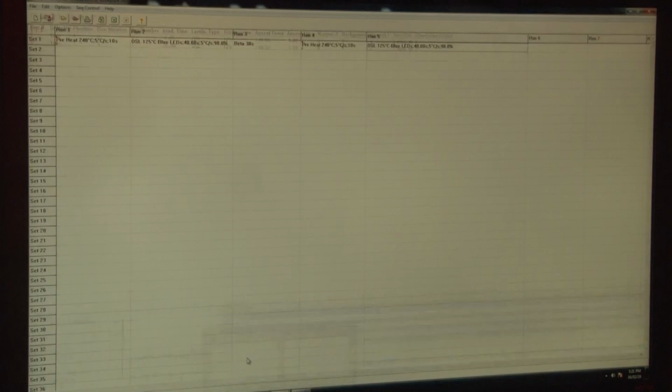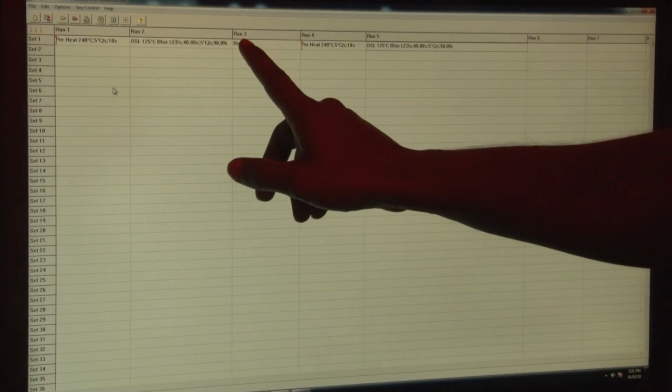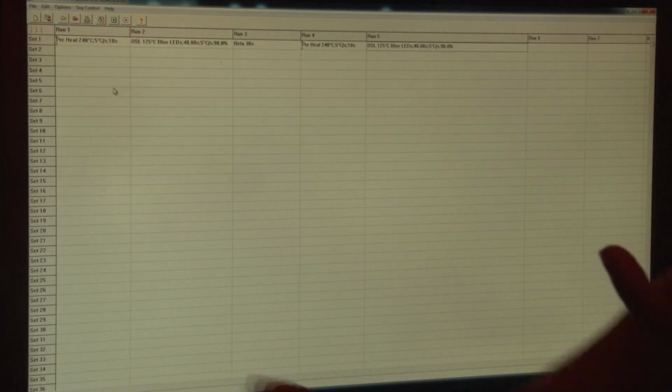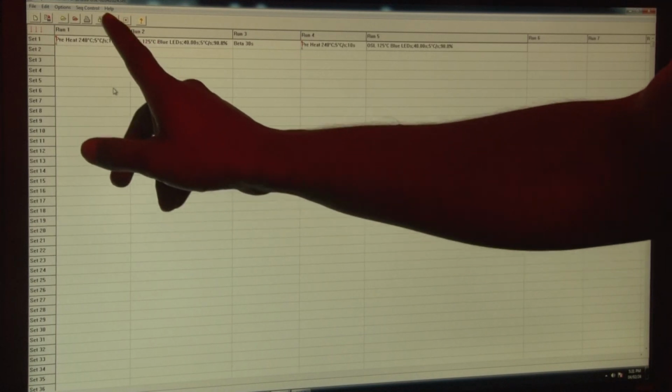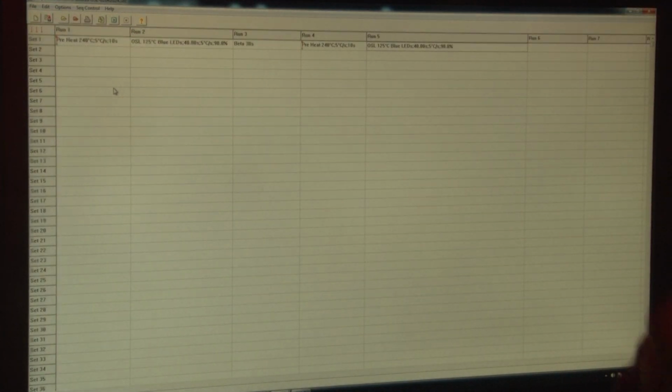In the sequence editor part you would see that we have applied 30 seconds. If we are applying the 30 seconds and we are getting 250 photon counts, what would be the dose for this section if we are getting 170 photon counts?